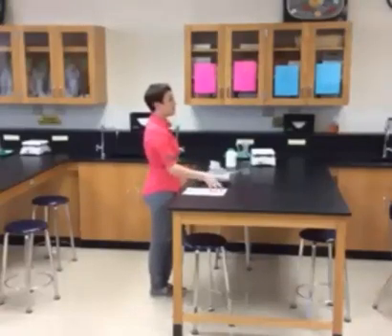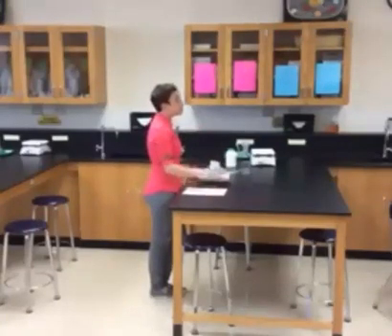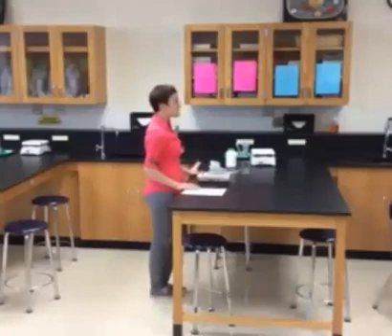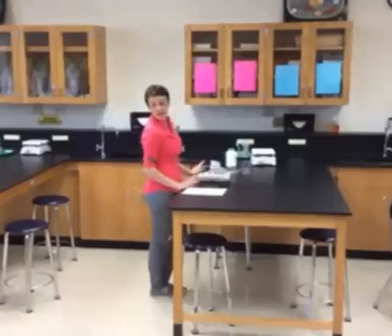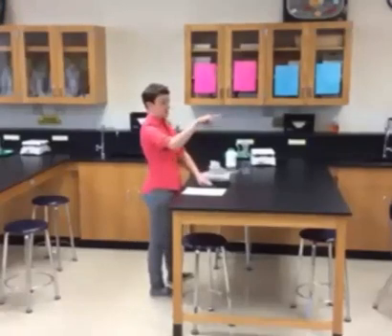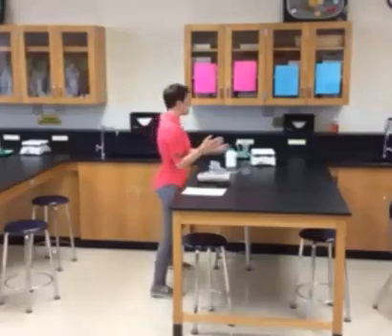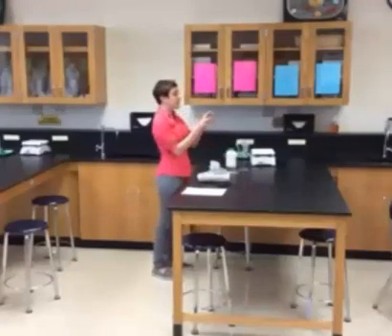We don't have sugar-free Jell-O; we only have regular Jell-O with sugar. So tomorrow I want you looking at the top set of directions. You guys are going to be working as a lab station. One person is going to measure out 60 milliliters of water using a graduated cylinder — the tall skinny ones — and put it inside the beaker.